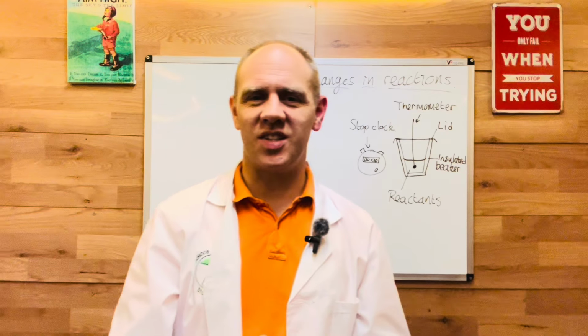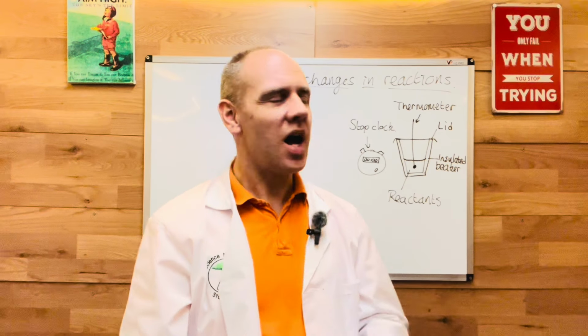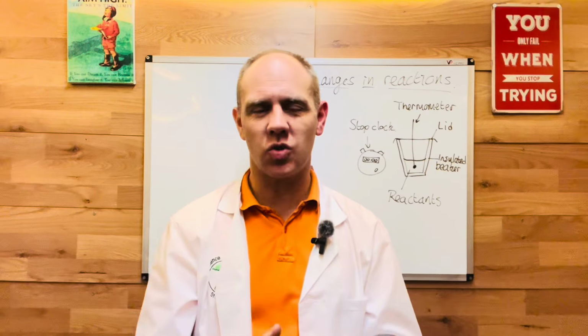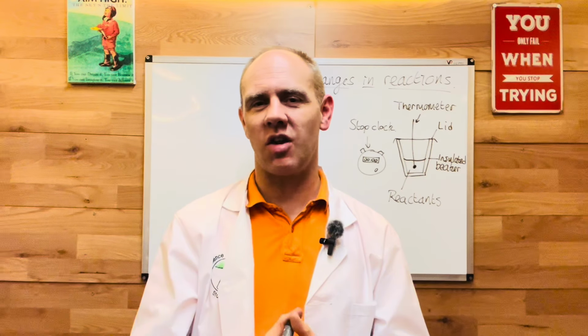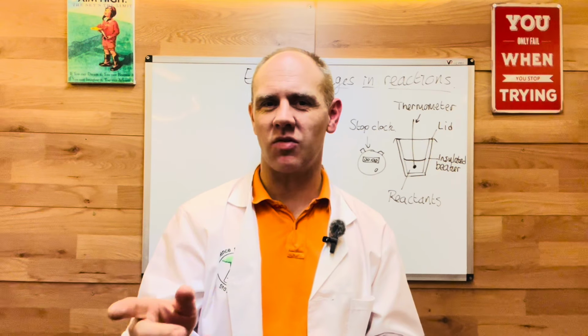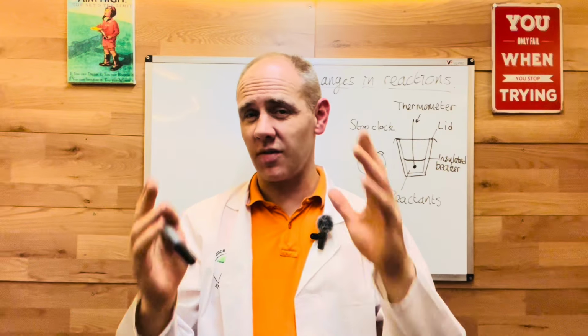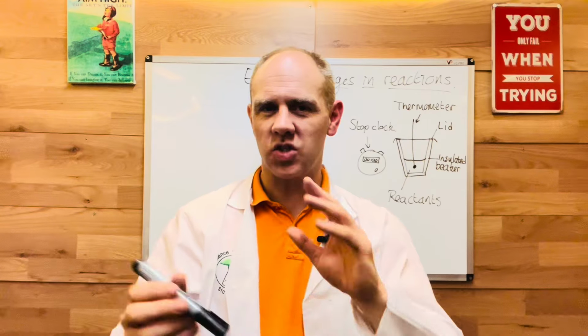Hi, I'm Paul. This is Science That Sticks, and in this session, I'm going to show you what equipment is always required in those questions, what sorts of reactions there are, and why they tend to mess around with other modules where there's other chemical reactions taking place. So let's have a look at the kit that you'll need for these sorts of questions.